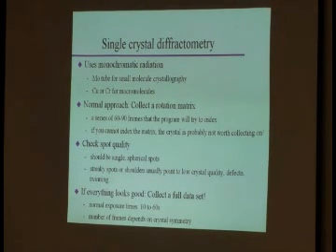Why might the matrix not index cleanly? Well, you could have several crystals mounted. What are warning signs for that? First of all, if it cannot index a large number of reflections, that would be a warning sign. Sometimes it's more subtle. Okay? One of the things you want to check is your spot quality.